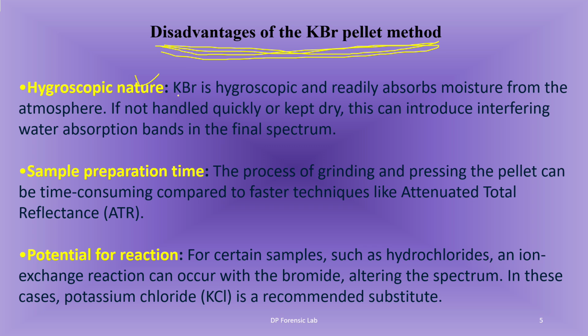KBr is very sensitive to moisture. So whenever you handle KBr powder, you should be very careful. Keep it in a dry place and don't touch the sample directly by hand. Always use gloves, and as soon as possible the plate should be made and put in the chamber.